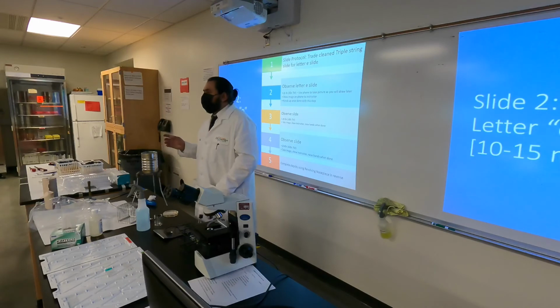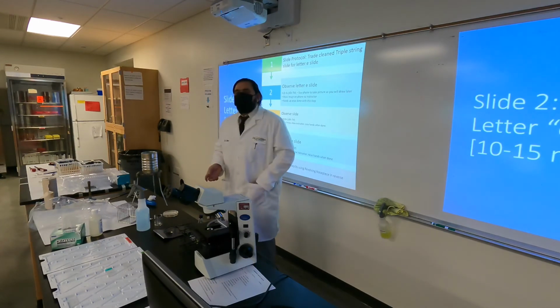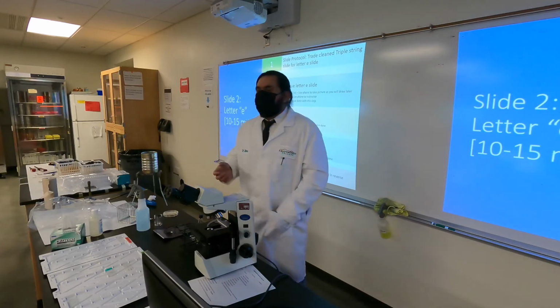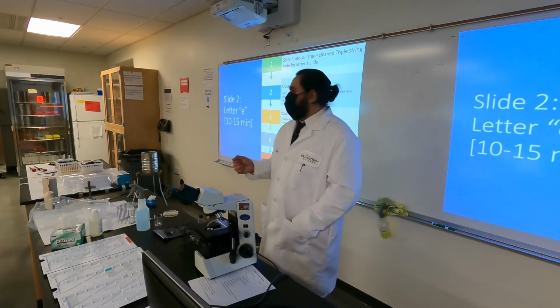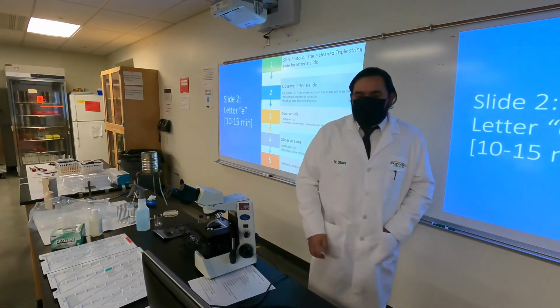And make sure, again, that you turn off your flame, allow your water coffee can to cool so we can pour the water away a little bit later, and we're done pouring our plates. Then we'll continue on with our letter E for the moment.